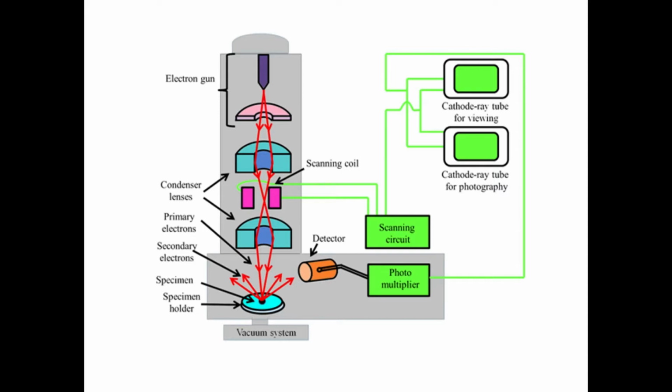Okay, so without a vacuum, the electron beam generated by the electron gun would encounter constant interference from the air particles in the atmosphere, and you know that when electrons pass through the atmosphere, they produce an ionization effect, which is also going to spoil your output. Okay, so before reaching the object, their energy will be lost, because they are going to cause ionization one by one, so it will lose energy.